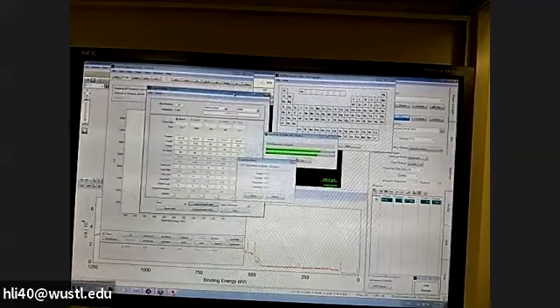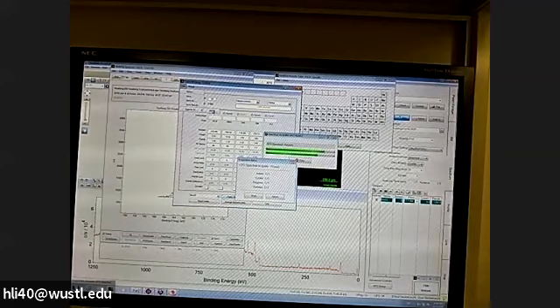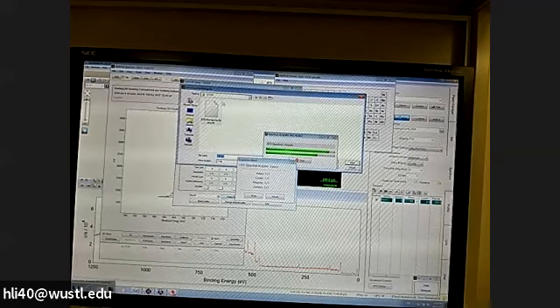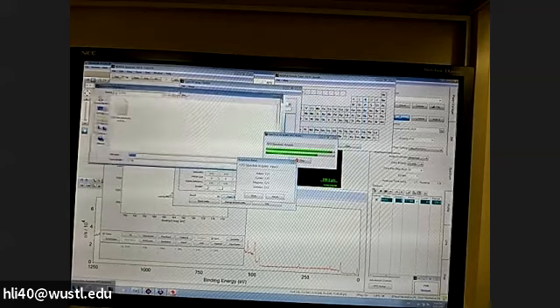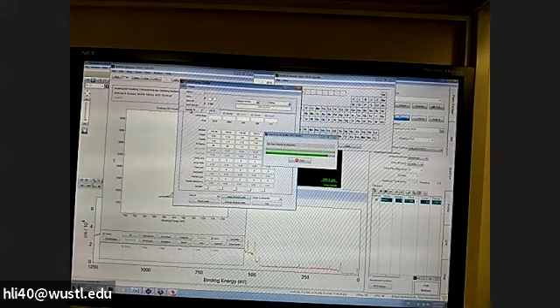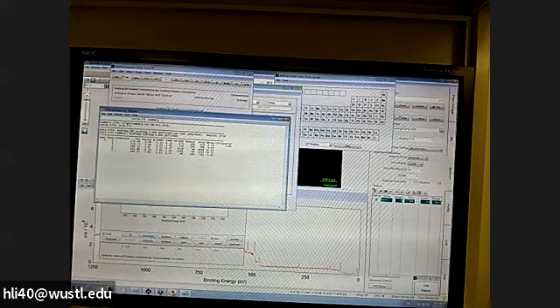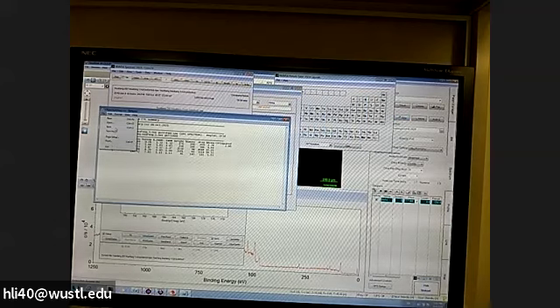If you like the fitting curve, you go to File and export to S2 format. So you will see your fitting curve. Or you can save as. Okay, so it's a fit. Normally I would say use File, export to. And if you need this table, you can go to View, Summary. So this will give you the table, and I go to File and save.